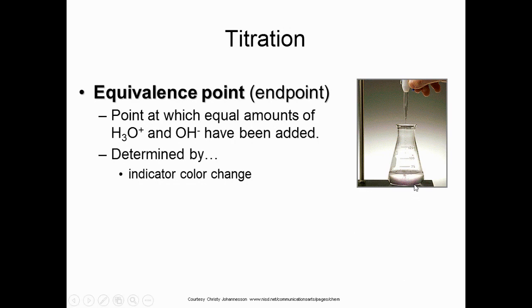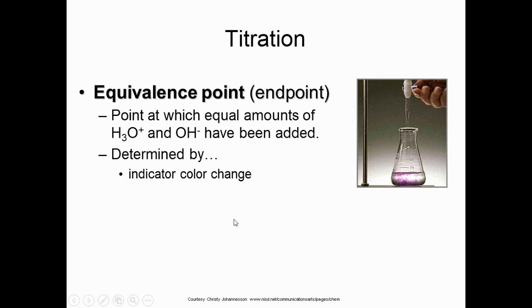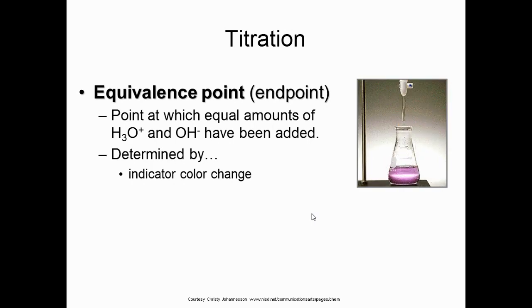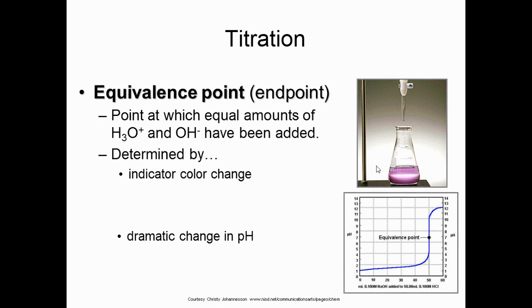So we can see we have a little flask here. We're adding a liquid to it, a liquid that we know its concentration of, into one that we don't know. And initially it's colorless, and we add that up and shake it up and it stays colorless. We add a little bit more, we can start to see some pink color. We give it a little shake, and if that pink color stays, we've reached the end point. It's gone from colorless to pink, and that color change stays. So we add our known material until the point at which the color changes and stays, and we stop at that point. It'd be a very dramatic change in the pH causing that color change.